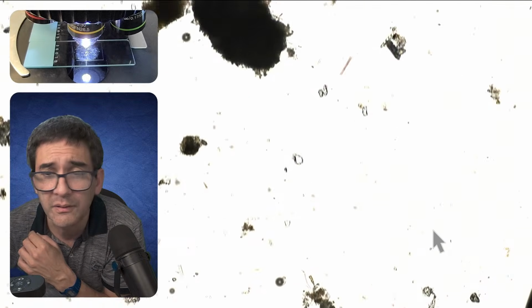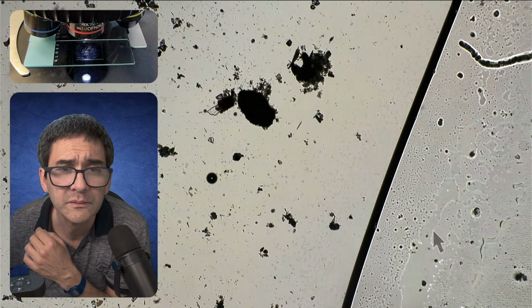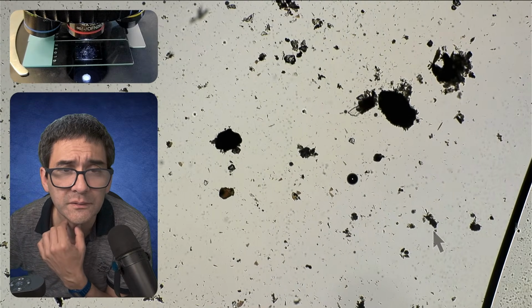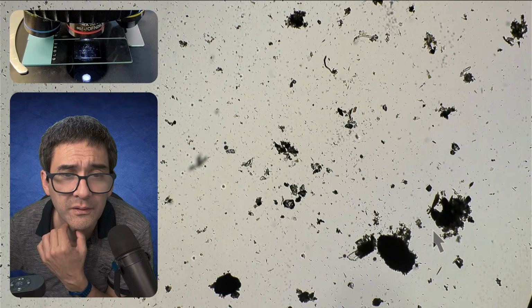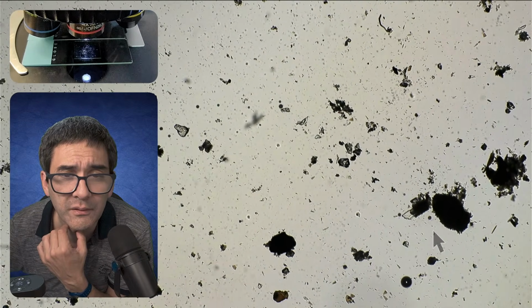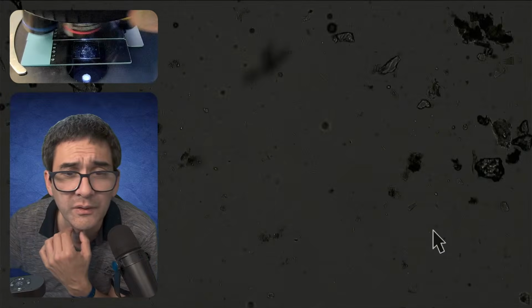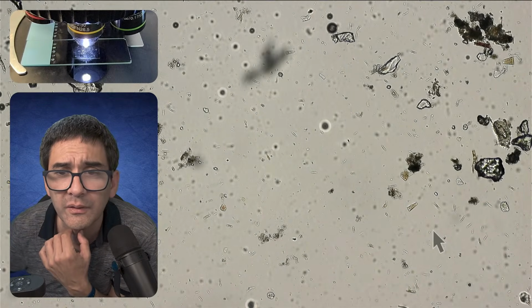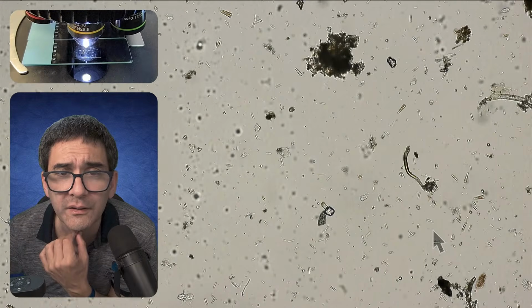Again, patience is needed. I don't know, is this the one over here? Yeah, if we don't find it.